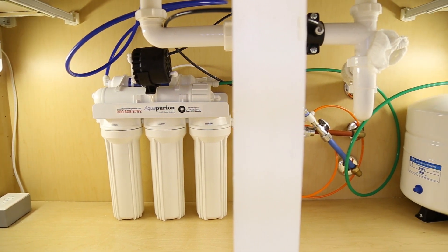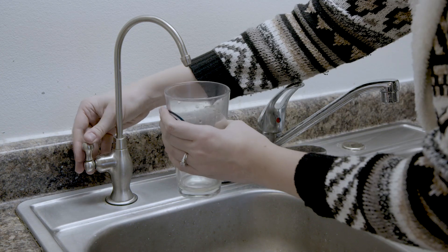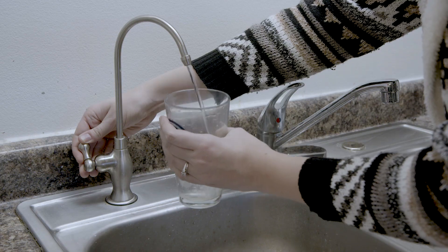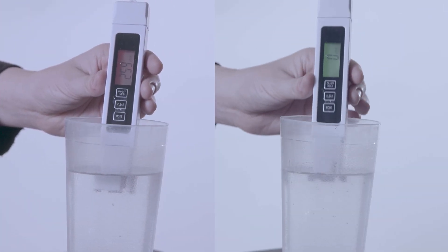So how do you know when it's time to change the membrane? The answer is you don't, unless you have a TDS meter. Measure the TDS of your tap water, then measure the RO water for comparison. The RO water should be about one-tenth or less the TDS reading of the tap water. For example, if the tap water reads 300 parts per million, then the reverse osmosis water should read 30 parts per million or less.